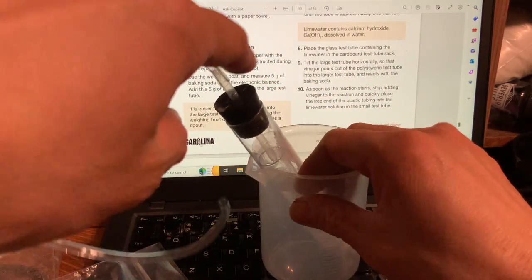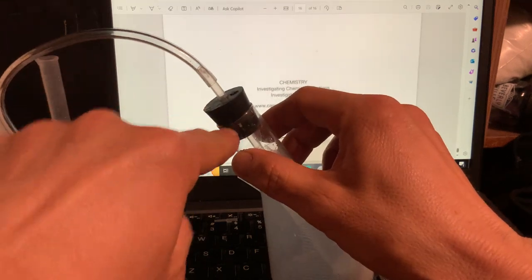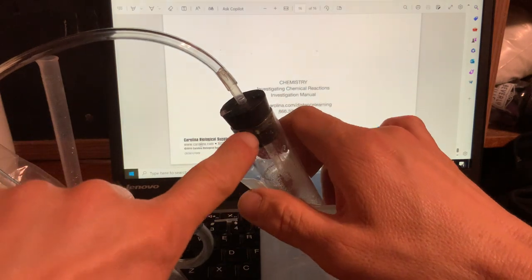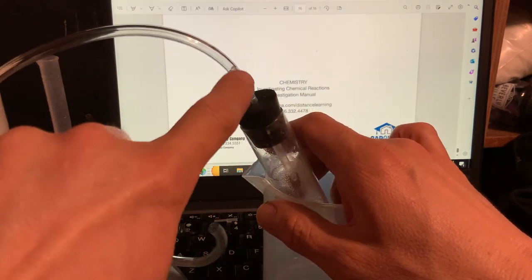Now, you have to put this on quite tightly. It's not just put it on. You have to jam it on there, so no carbon dioxide gas escapes through here. It has to only escape through the tube.